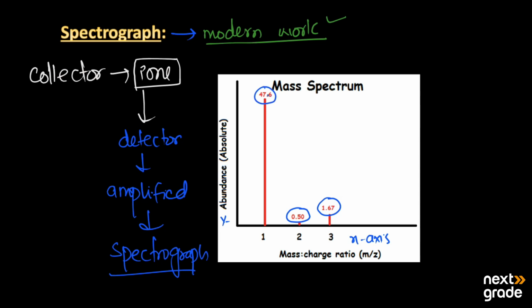So how does the mass spectrometer work? Basically, the work is to find the mass of the different isotopes. To find the mass of isotopes, we use the mass spectrometer in which the sample is placed, and at the end we record the result in the form of this spectrograph. From here we can get the average masses of the isotopes.